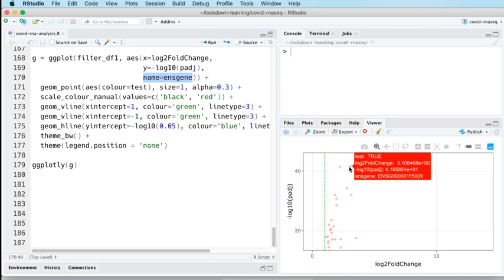It's amazing how much the inflammatory system is involved in all sorts of diseases, whether they're recognised as inflammatory diseases or not. But despite that, I could not tell you a single mapping between an Ensembl gene identifier and a human readable gene name or a description for that gene. They do not fit gene IDs onto a plot like this.